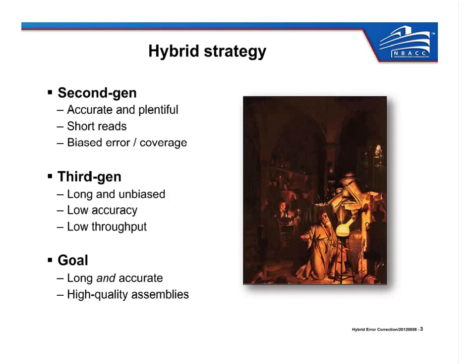So really the complementary aspects here are what intrigued us in using this hybrid error strategy, and we set out to prove that the third generation error rates could be effectively managed by combining it with short second generation reads. And the results have been quite spectacular, so Sergey will present in the results our assembly of the parrot genome that produced an assembly that was about twice as good in terms of contig continuity as previous bird genomes done with Sanger sequencing even.